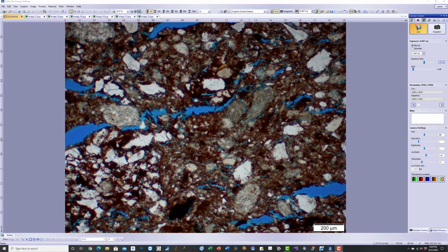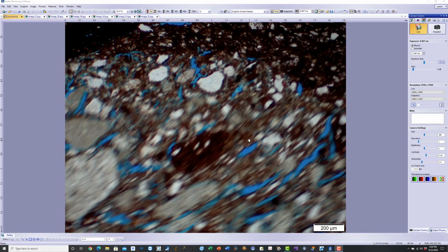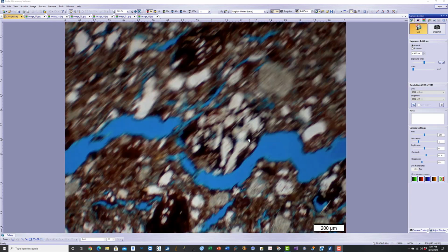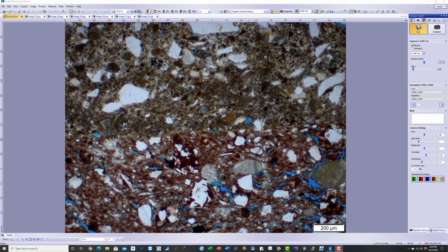So this is a typical brick microstructure with parallel, elongated voids from the loss of water during firing from the clay matrix. And then on top, the inner wall of the chimney, you have refractory mortar. And this is the interface between the brick and the refractory mortar.